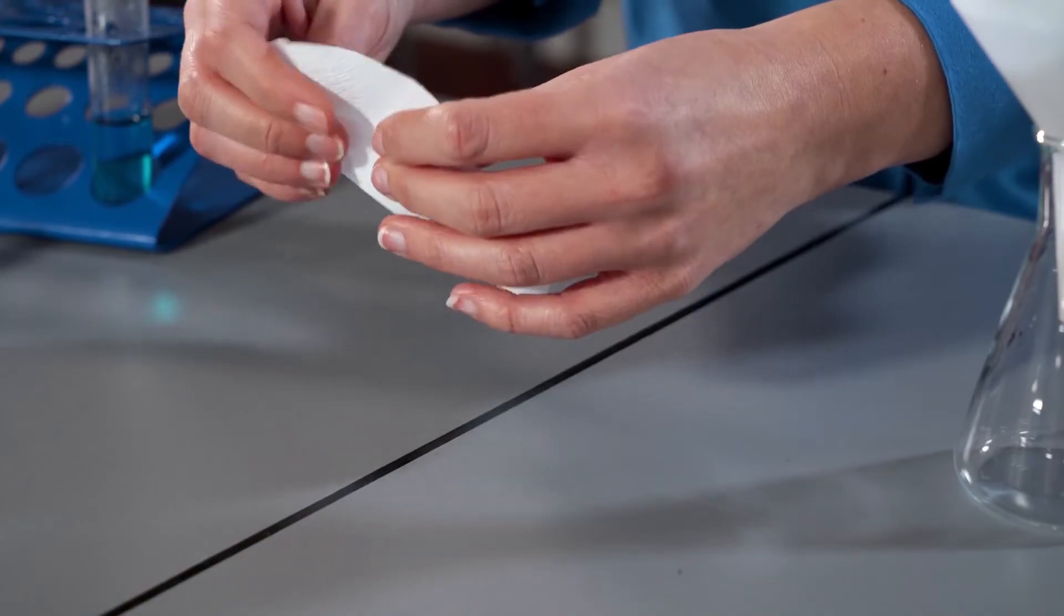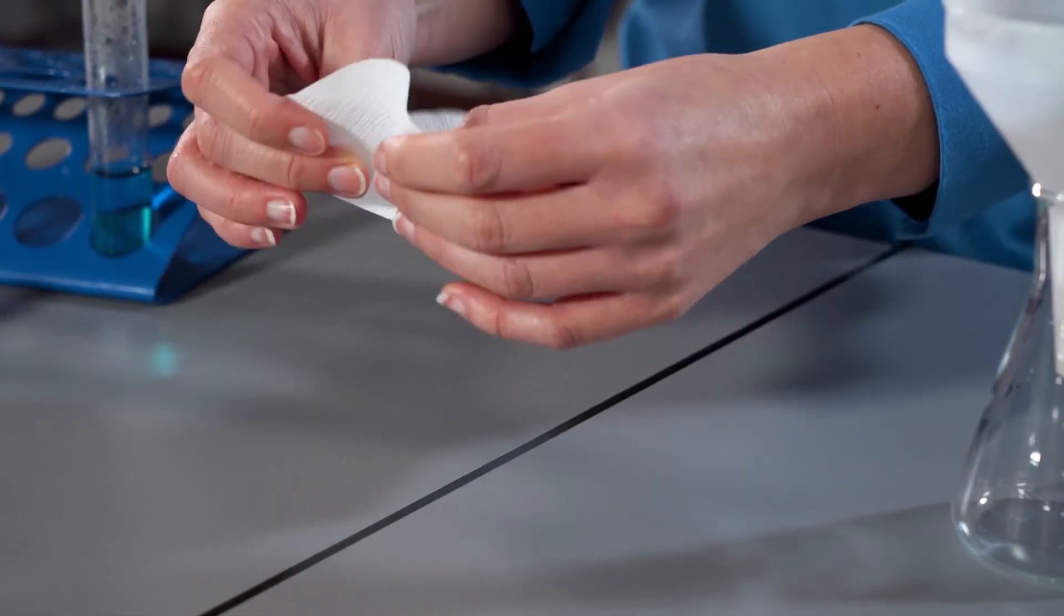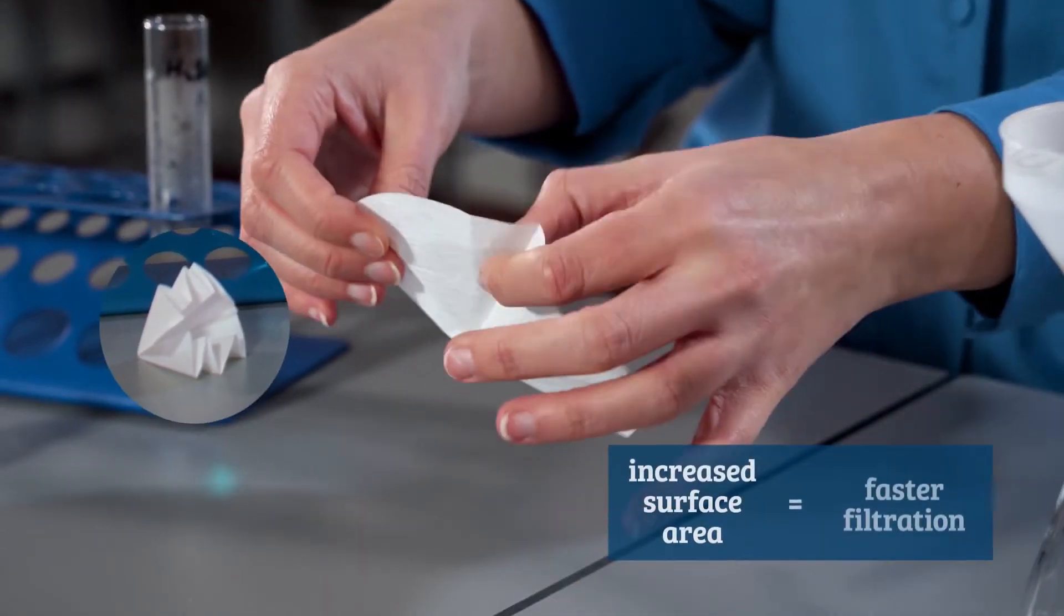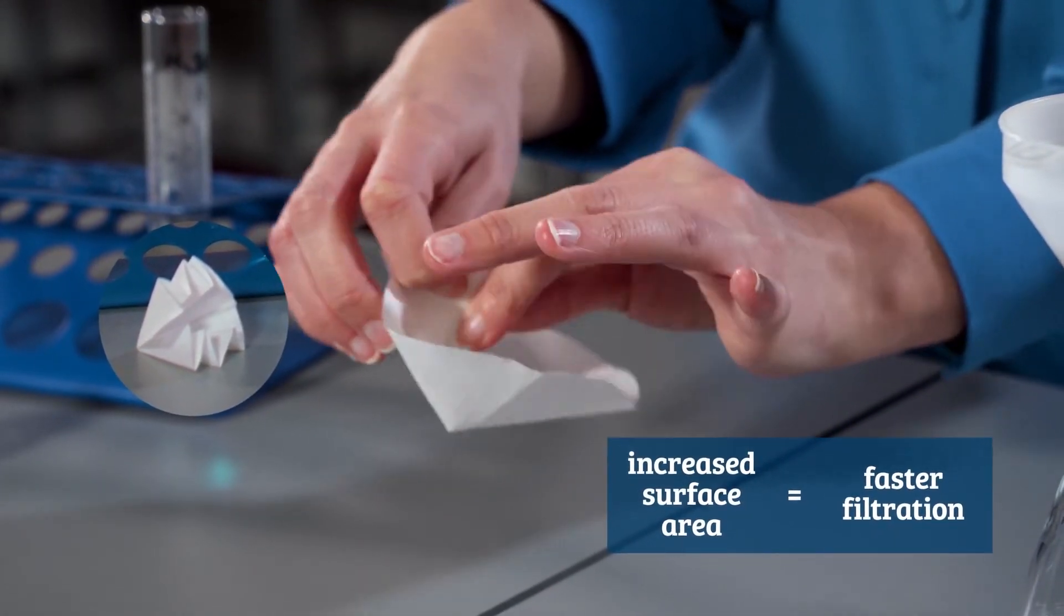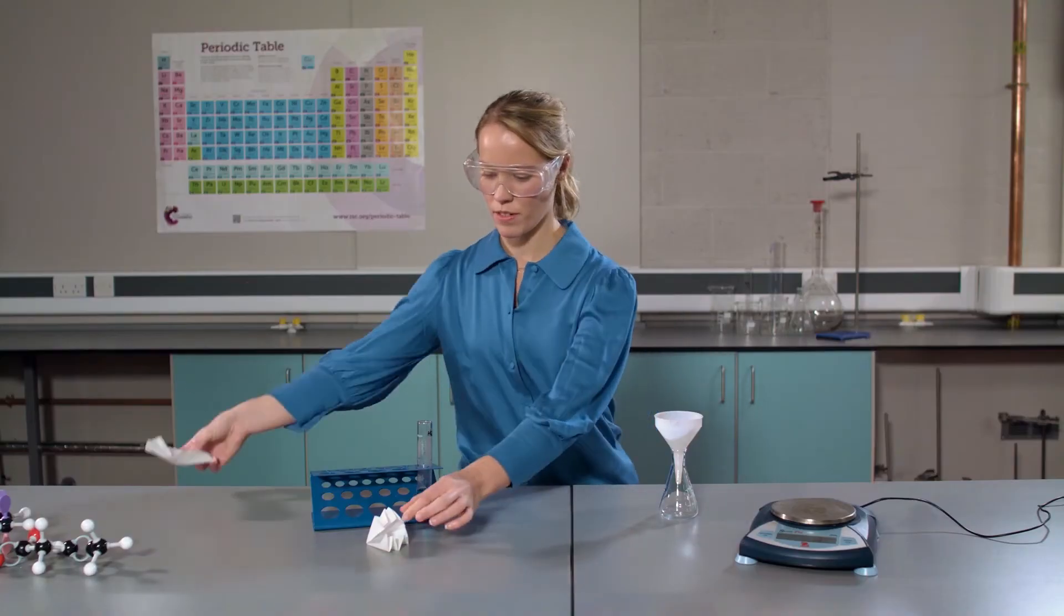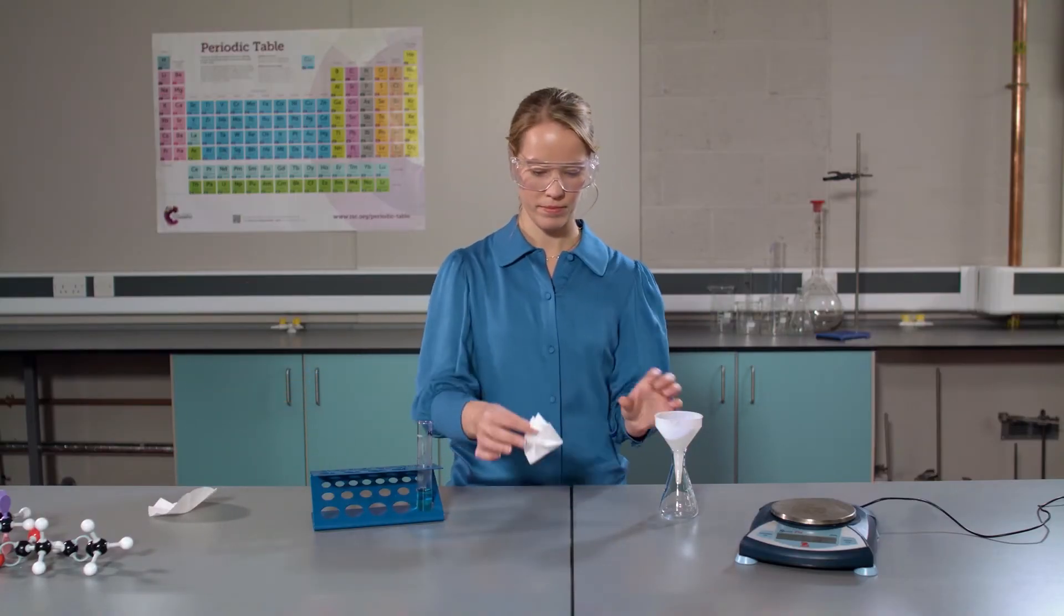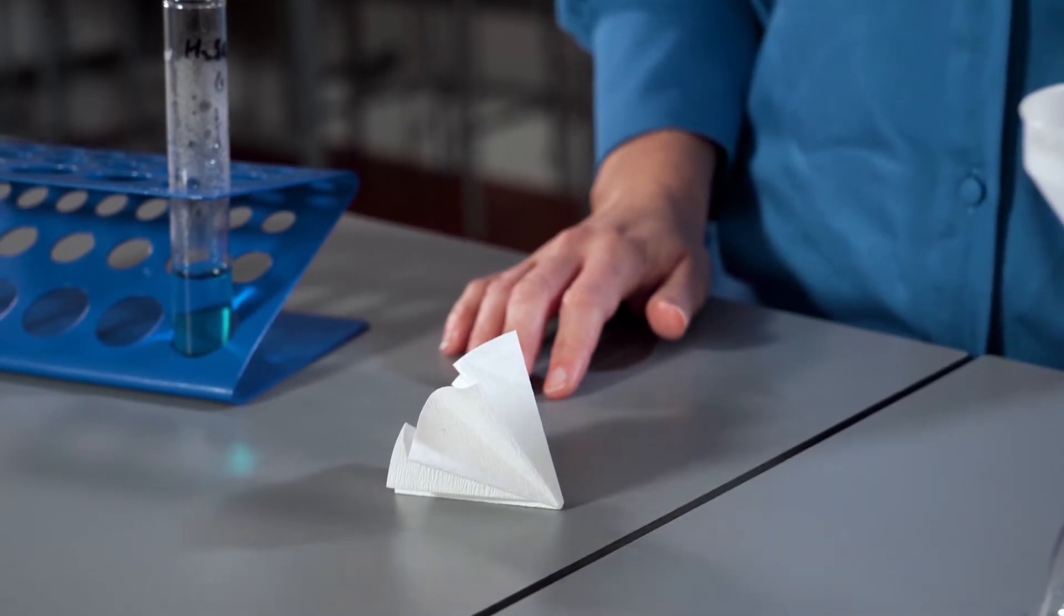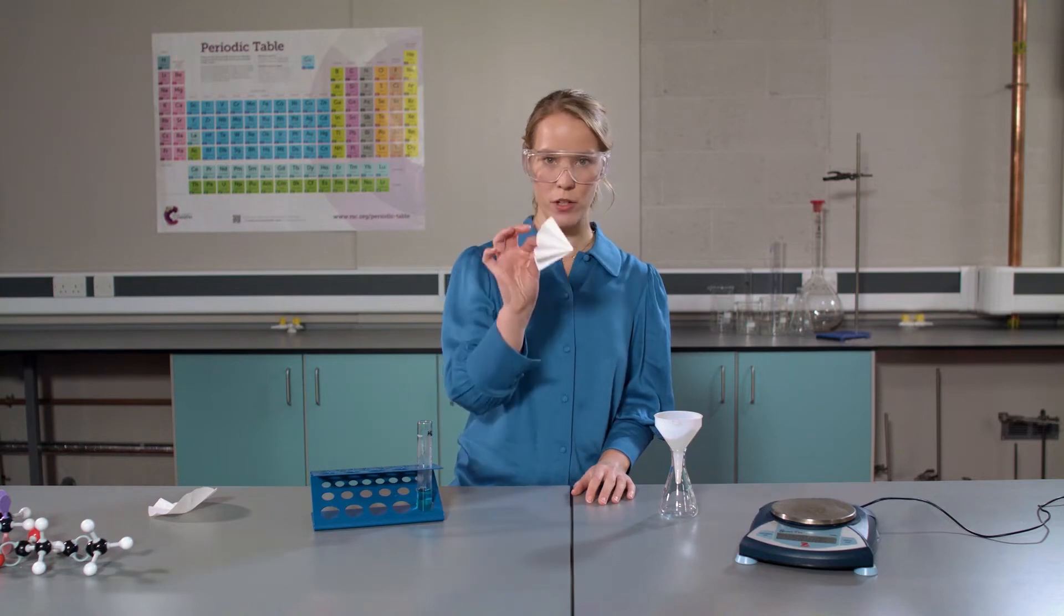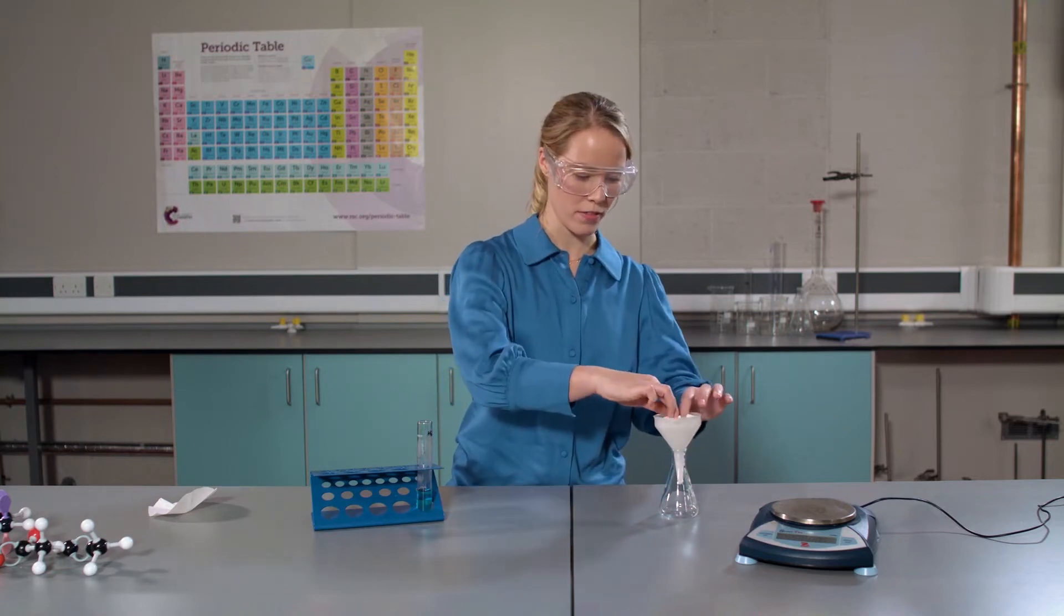We will then start making indents between these segments. Here is one I made earlier. I have already placed a filter funnel in a 100 centimeter cubed conical flask and I will place my fluted filter paper into my funnel.